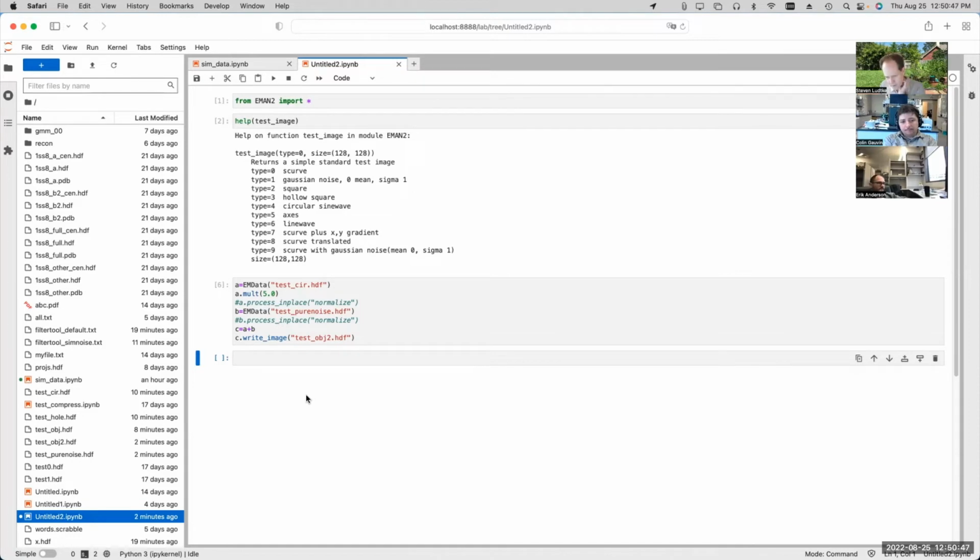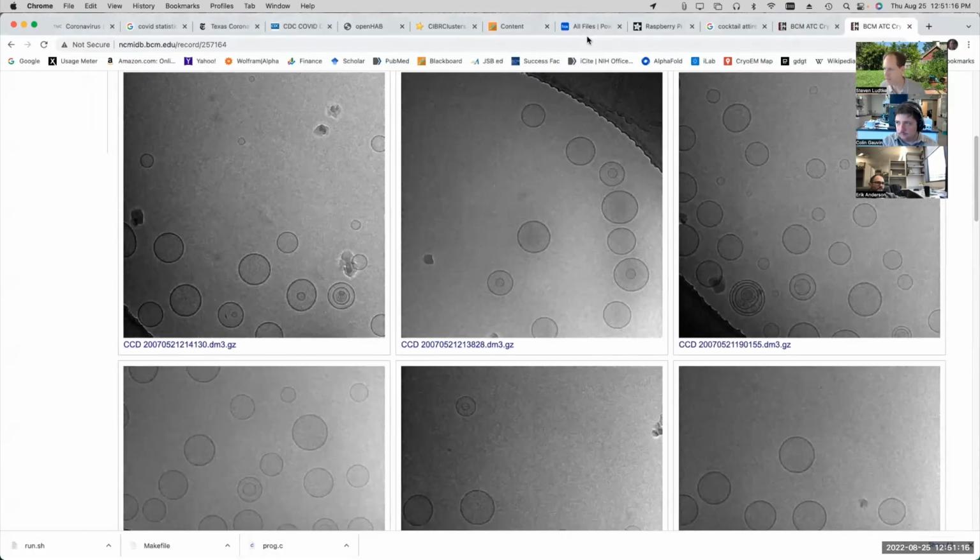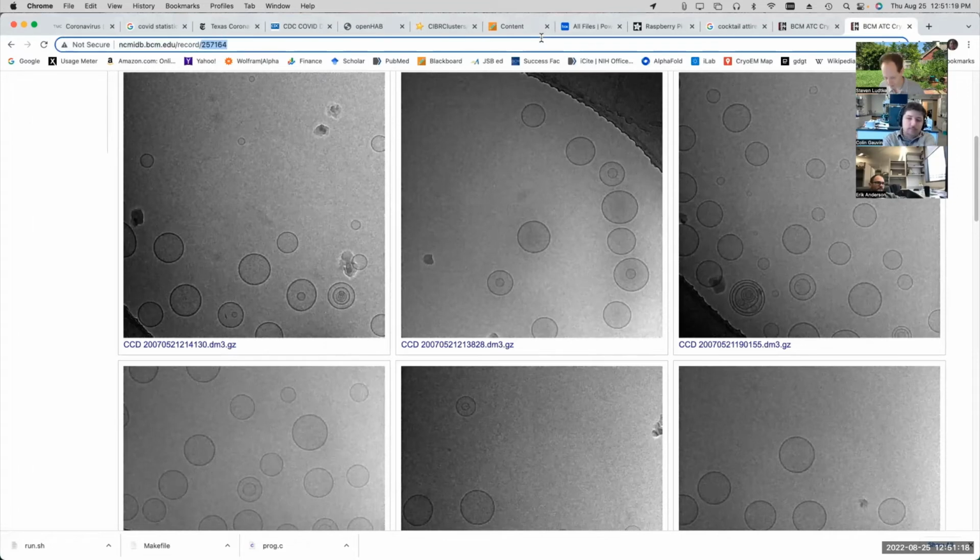Okay. So the other question that came up was about HDF and storing things as HDF, and some of the confusions that you run into if you start doing deep learning in TensorFlow with HDF files. EMAN has this HDF file format that it uses. This is HDF5. It's a standard, interdisciplinary file format.